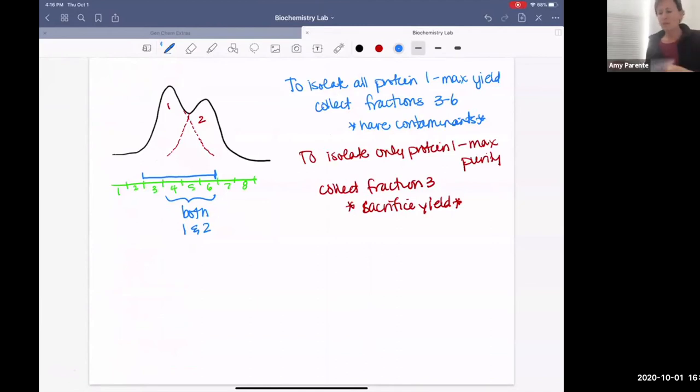Okay, so the next part, and I'm going to walk through it with the reason number 10 is not on there, is that's my protein. That's my demo protein. So I'm going to walk through what you guys are going to need to do with your own proteins.